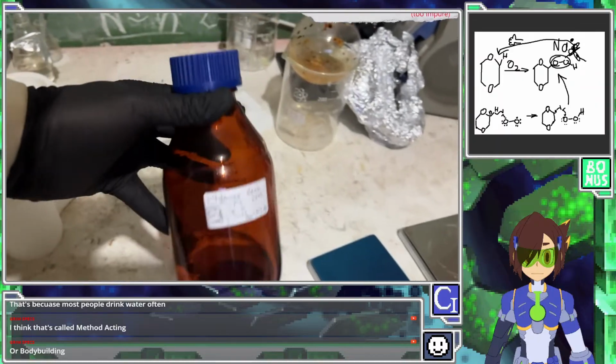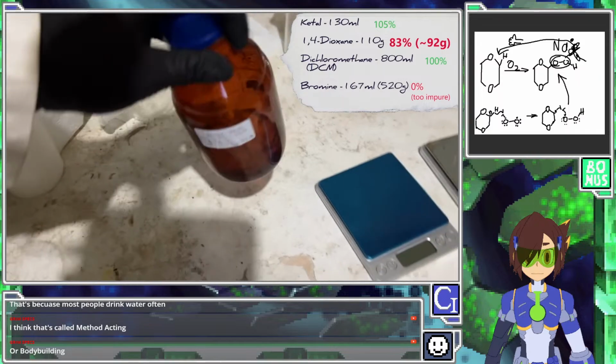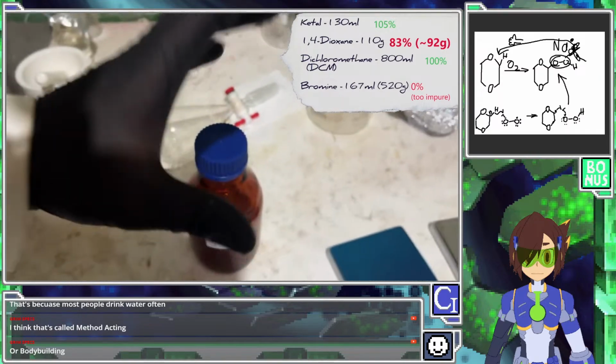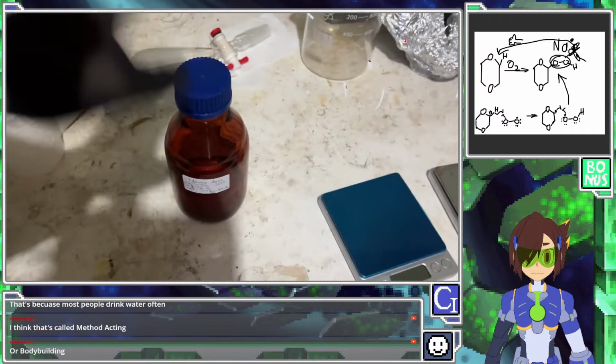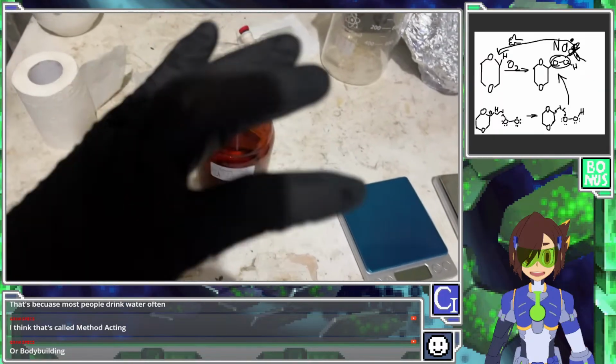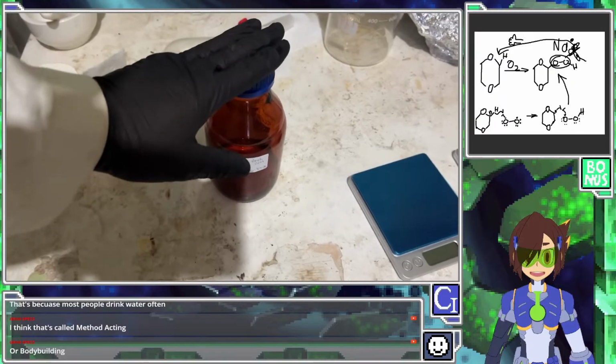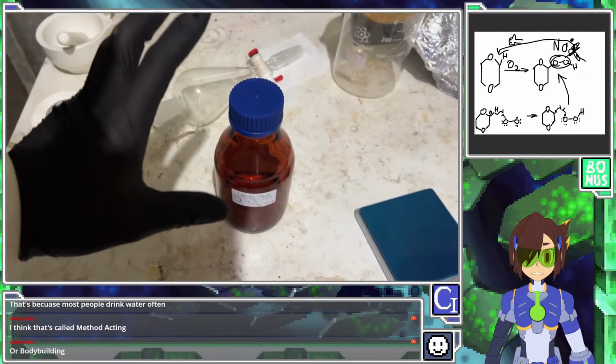91.7 grams of dioxane, which is less than 110, which means we're going to have to scale down the overall reaction. This shouldn't be our limiting reagent. Tom, you could just do it again. You could just do the ethylene glycol thing again. You can go to Bunnings and buy another 1 liter. They're not going to shoot you for doing so.